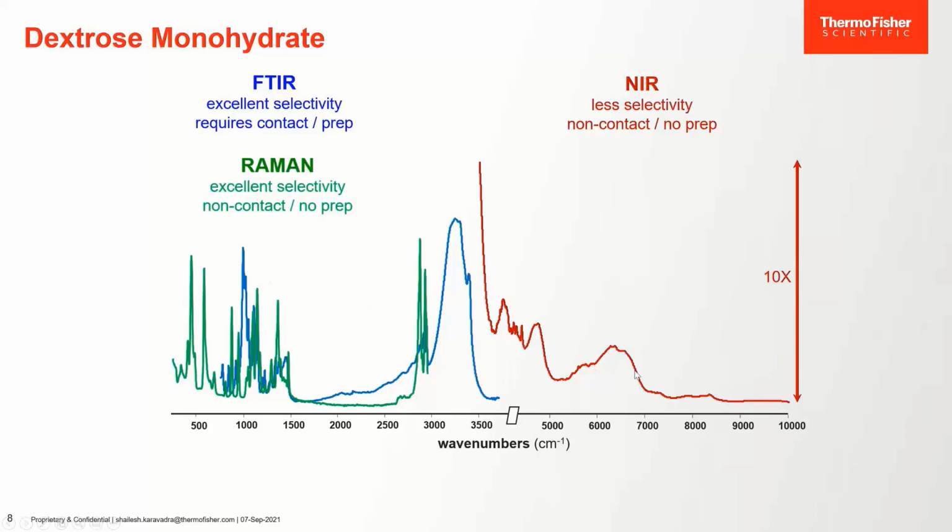In order to analyze this kind of spectrum, you would look at either the full shape of the spectrum, or you look at specific absorbance levels in the X direction. Because the spectrum is so broad and peaks cannot be easily identified, in order to gather the information from such spectra, you have to use certain algorithms, for example PLS for quantitative.